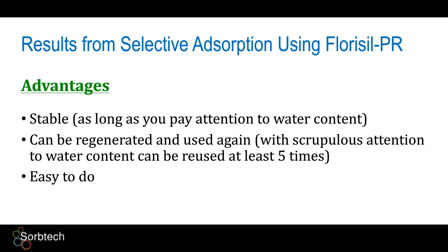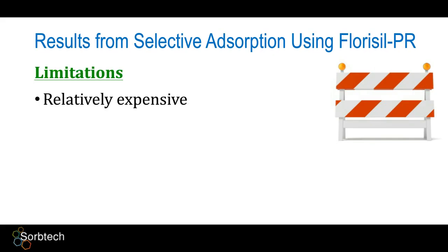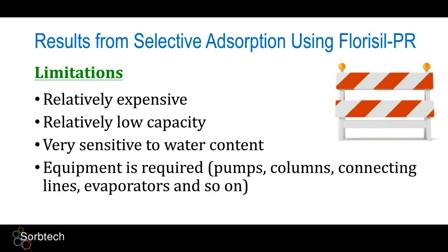So the limitations are that Florisil PR is relatively expensive. It's got relatively low capacity. It's pretty sensitive to water content. And again, equipment is required to do this.